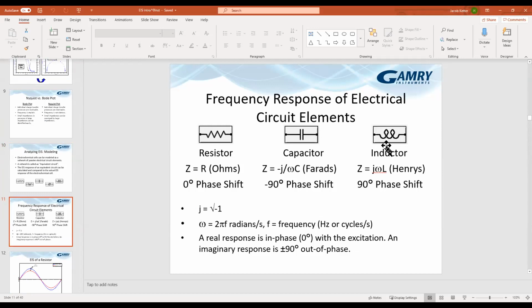At low frequencies, and now I'm going to talk about actual inductance, not bizarre system effects that are not KK transformable, but real inductance that you get at low frequencies is an effect of adsorption. It's not truly inductive, but it models as inductive, but it's actually a negative capacitance.